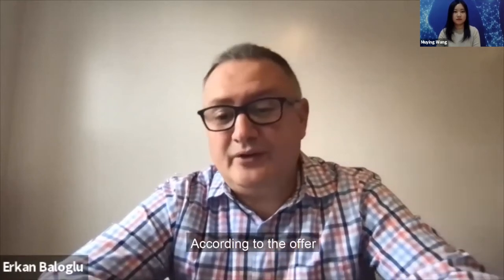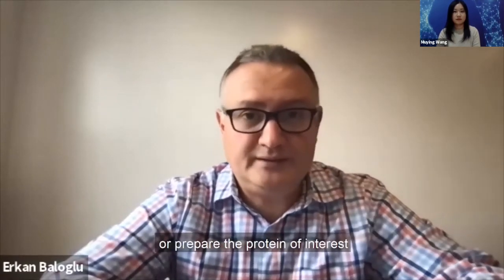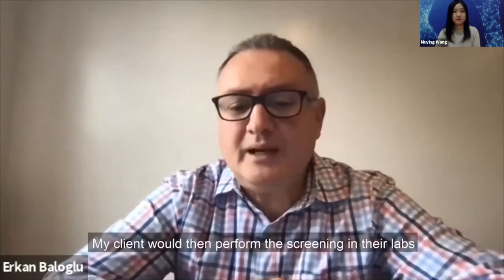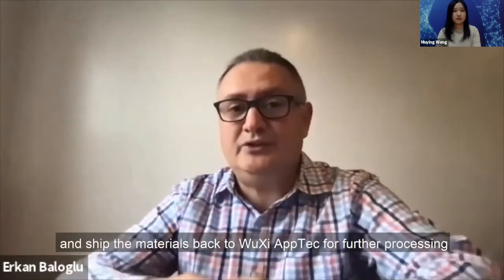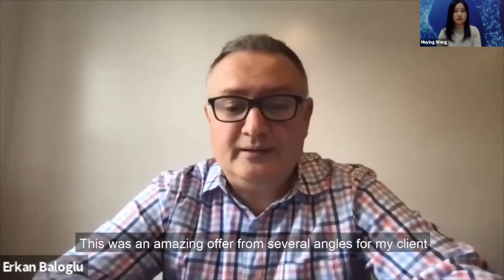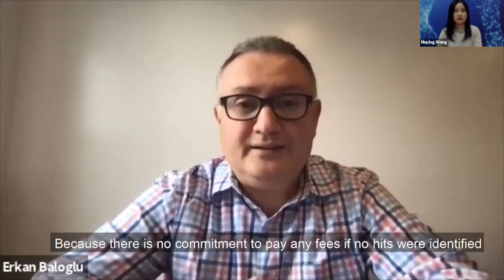So according to the offer, my client would prepare the protein of interest. WuXi would ship the DEL Open kit. My client would then perform the screening in their labs according to the procedures and ship the materials back to WuXi for further processing. This was an amazing offer from several angles for my client because there is no commitment to pay any fees if no hits were identified.